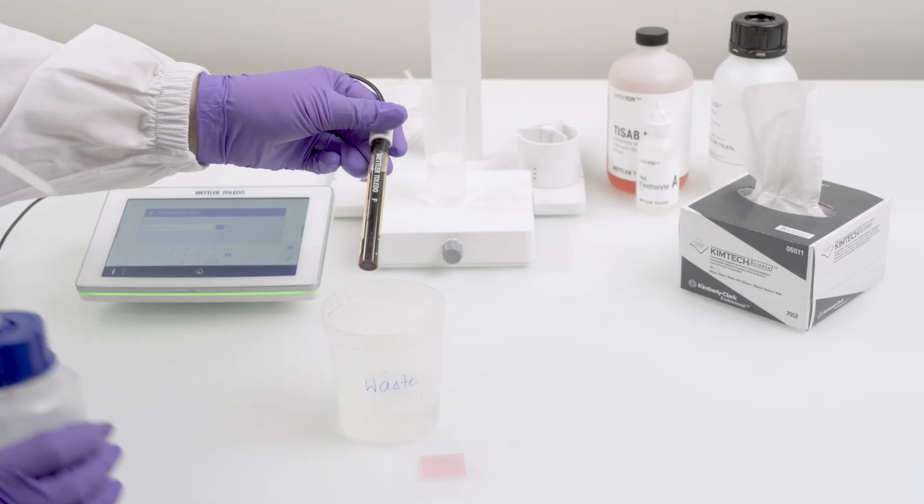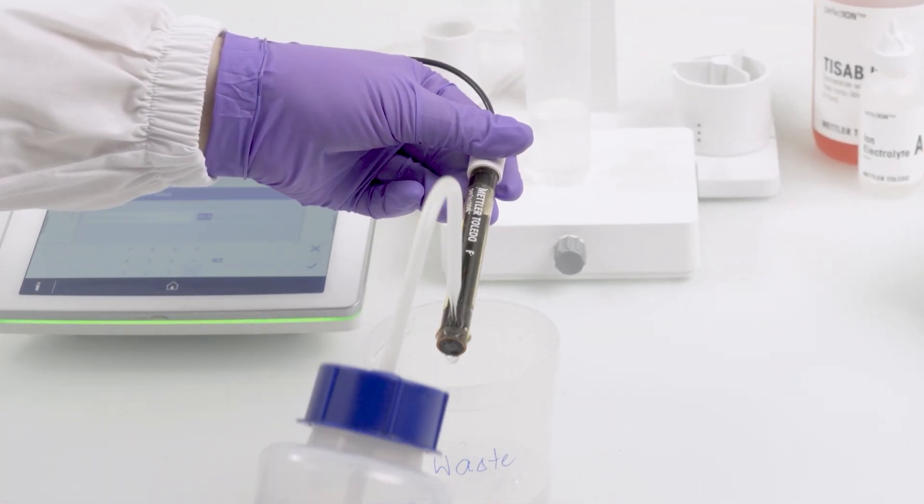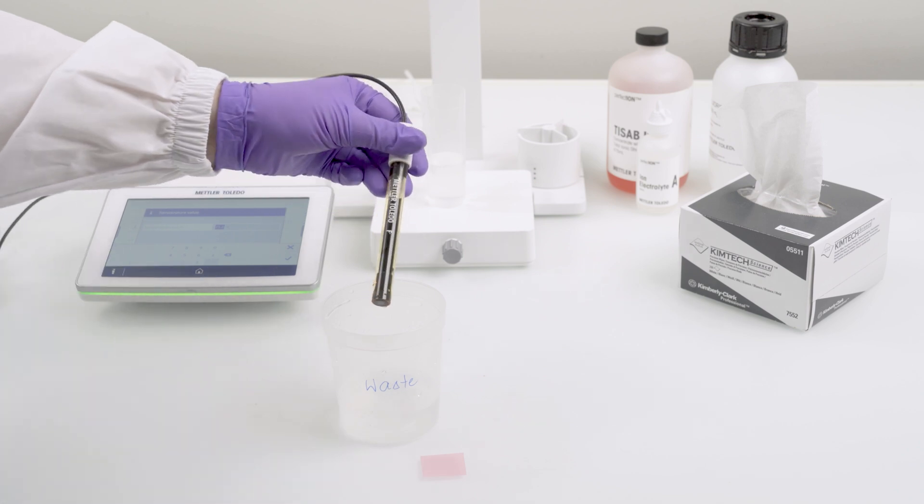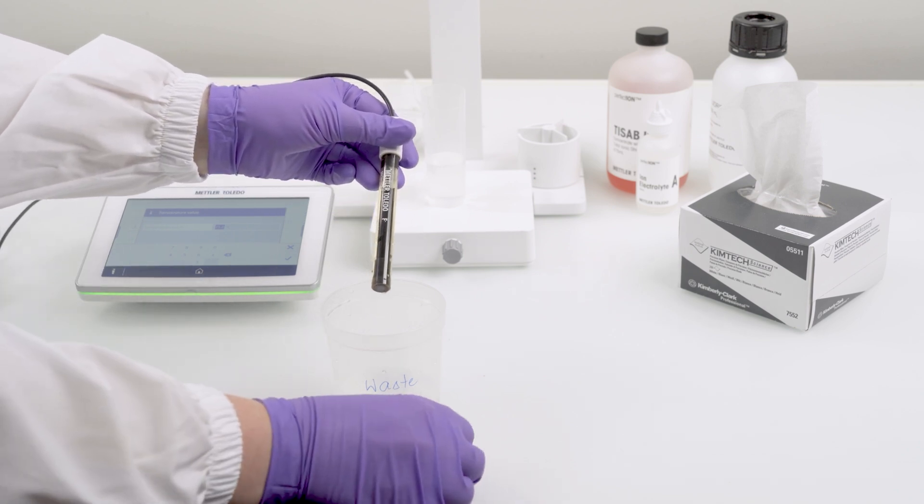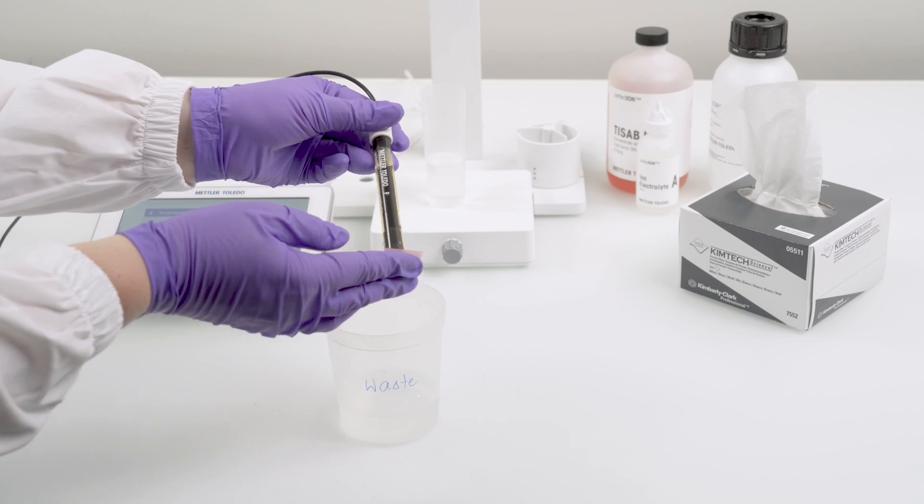For solid-state membrane sensors, start by rinsing with ethanol to remove any organic deposits. After rinsing, gently polish the surface with the fine emery paper that comes with the electrode to remove impurities.